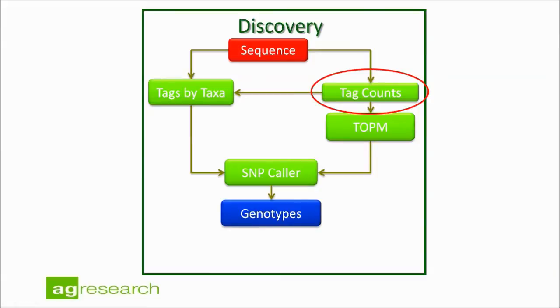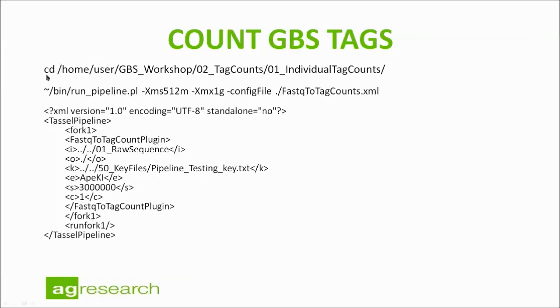The first step we will perform is tag counts. Here's our CD command — this has been set up to run with a bootable USB drive so the commands are tailored to that. We'll change directory into home/user/gbs_workshop. We're going to run this command calling a Perl file called run_pipeline, with memory requirements already coded in, and a config file — the fastq_to_tag_counts XML config file. I'm going to run it and then come back and explain what each of the bits inside the XML file are.